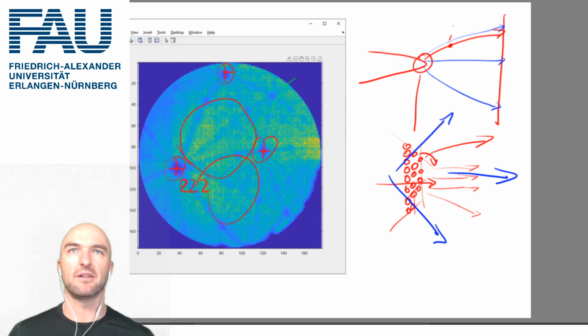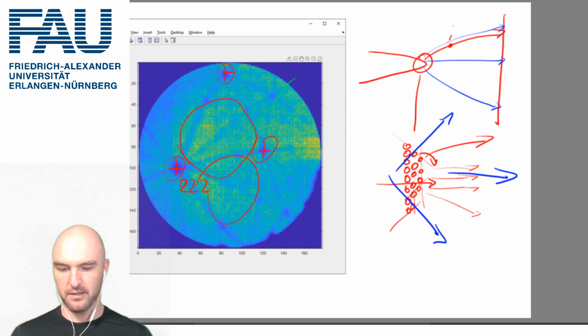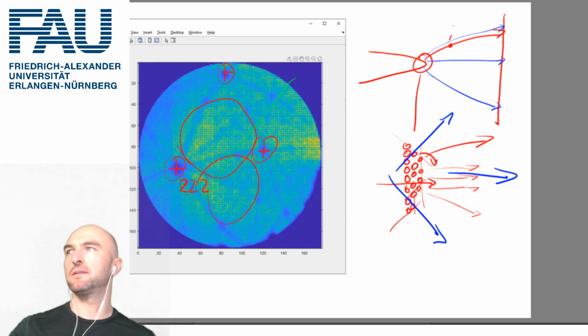So we'll just calculate the pin vectors from distance, and then we calculate our pixels now based on detector X and detector Y. This will take a second or two.